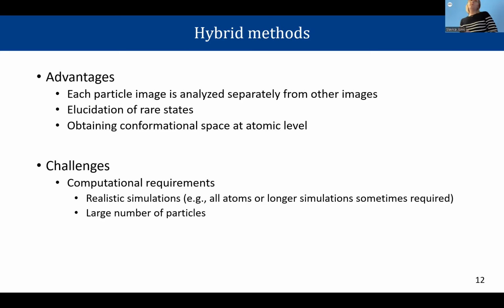This one, no. Because for this one, in particular, we really need one atomic model. It doesn't have to be a fully atomic model, it can be coarse grain. It can be experimental, but also can be modeled, because to get an atomic model, you don't necessarily need to do experiments with X-ray crystallography or cryo-EM. You can get a prediction with AlphaFold, for example. So we need atomic coordinates because this is important for MD simulation.